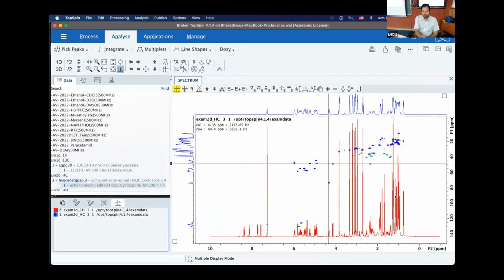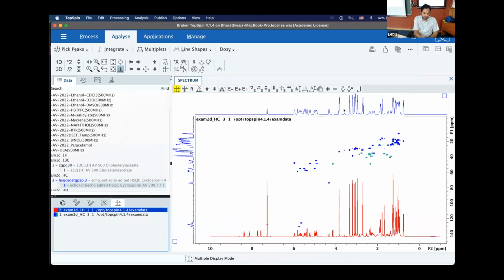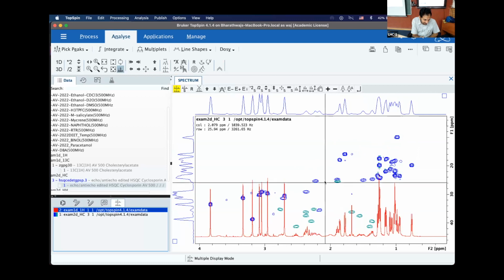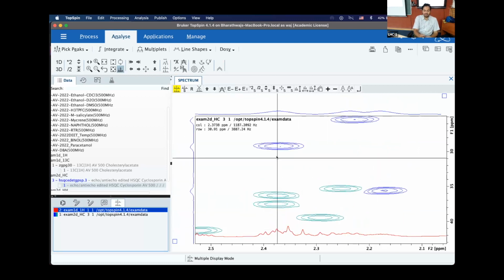is that the proton NMR is really complicated, which you see as a red trace. If you end up doing a carbon-proton resolution, so what do I mean by this? I'll take one nice example to exemplify this for you guys. Don't worry about the colors right now. Don't worry about what is blue, what is green. Are you guys able to see wherever I have drawn the trace?